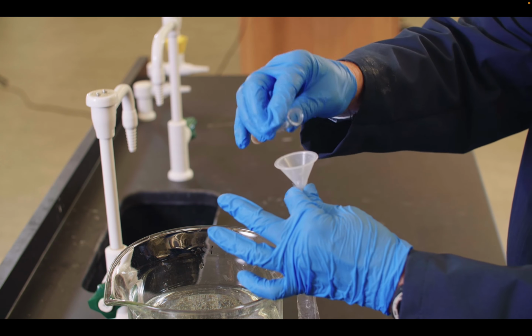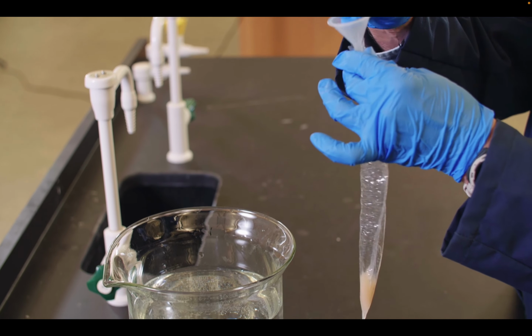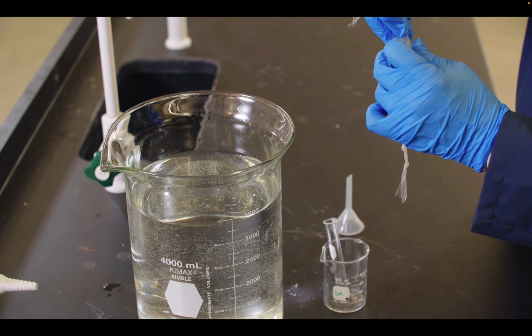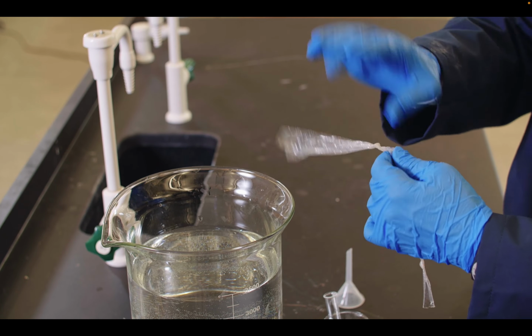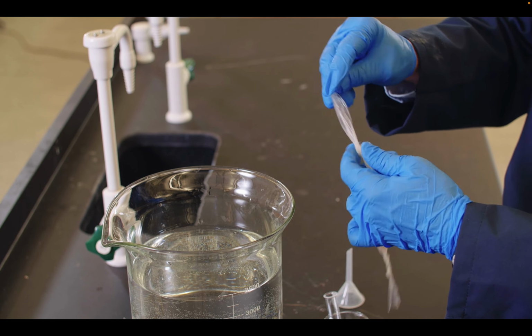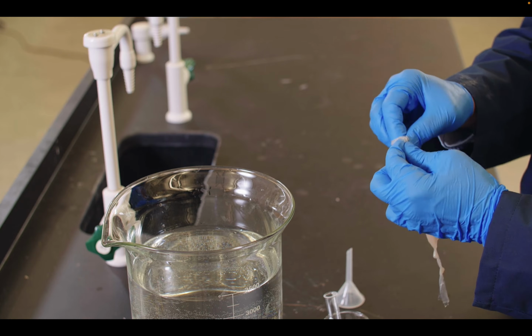And then we're going to just pour our solution, 3.6 milliliters of this, what we call AS2, so ammonium sulfate 2, this portion of it. And so we have that in. And so now we have a lot of extra tubing. That's all right, we just need a small amount for this, but we want to make sure that we have enough space to actually tie 2 more knots. If we just used a small amount, we wouldn't be able to tie our 2 knots. So I'll tie another one right over there, and those are right on top of one another, so just to be sure, 3 or 4 knots is better than 2.